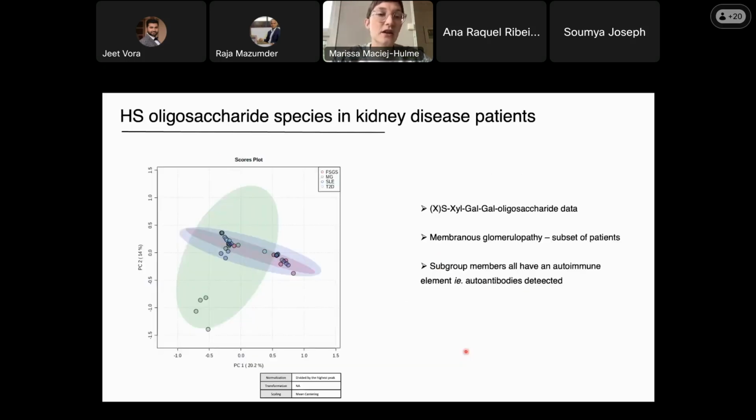If you take this data and you put it into the PCA matrix, you can look to see how similar or different the diseases are. And mostly, as you can see here, most of the kidney diseases cluster together, which is quite encouraging because, you know, kidney disease itself is different to cancer, it's different to Alzheimer's.